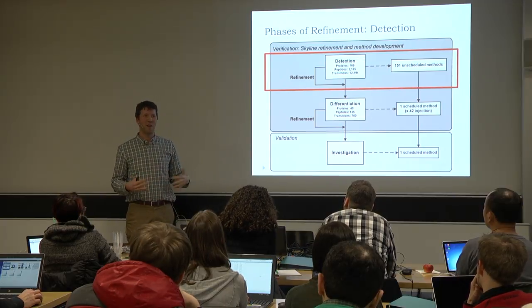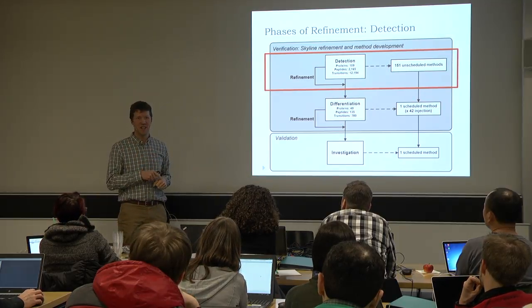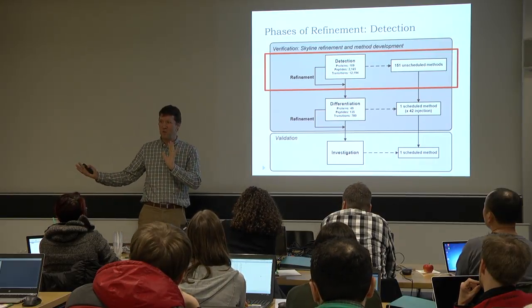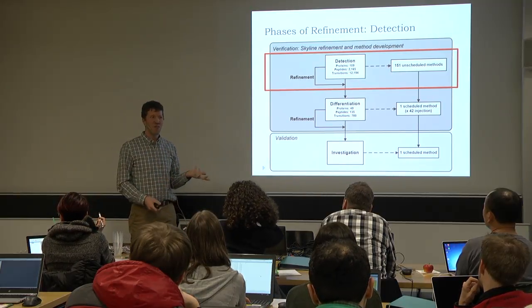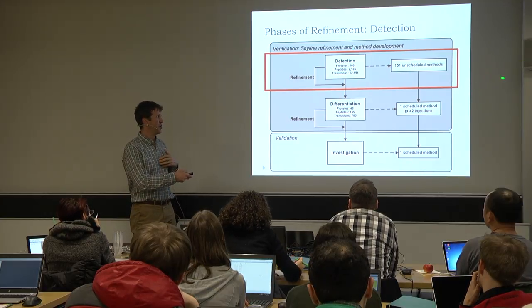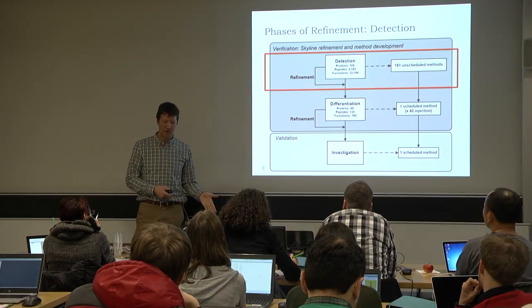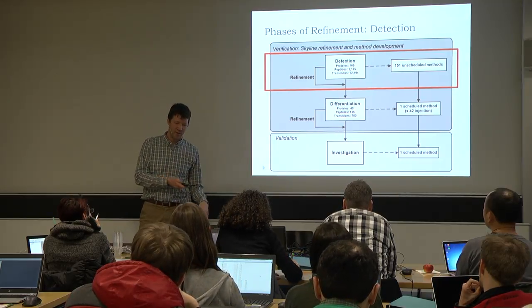Well, we have tools. We're mass spectrometrists. We have tools to figure out what that peak is. We can do de novo sequencing. We can do lots of things to figure out, if it turns out to be the highest value biomarker in our sample, what it was. So there was relatively low cost to not quite quantifying the right peptide, although we thought that we were probably, in most cases, quantifying the right peptides. But this differentiation phase was kind of interesting.